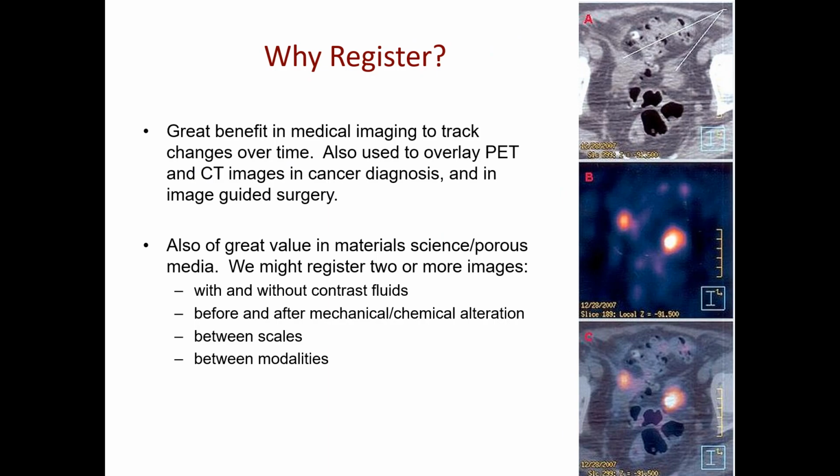Sometimes before and after some sort of chemical alteration, I might want to register things in the same position. Or I might have different modalities. Let's say that I have a sandstone imaging. This is often done to improve identification of mineral components.